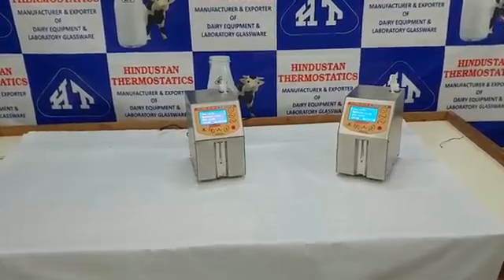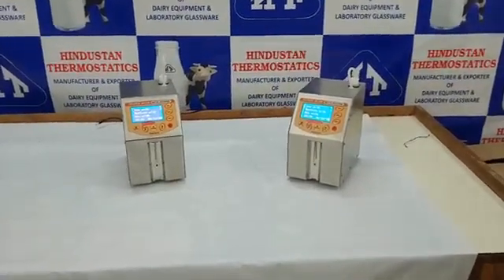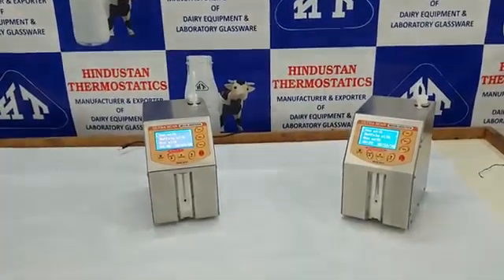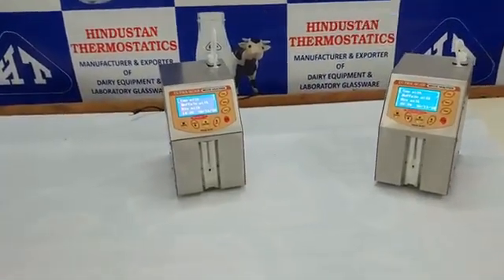PN Technology meets Indian affordable price — we call it the Ultrascan Milch Analyzer. Milch is a German word which means milk.